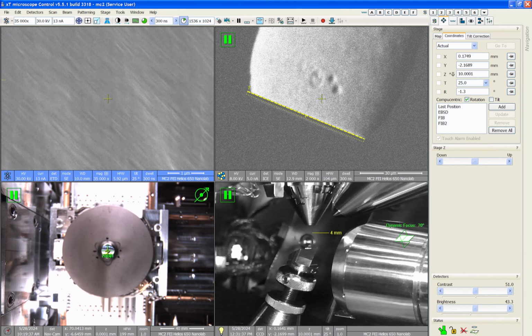Say none, SEM area. Let's see if I slow it down. Yeah, this is a little better. Okay. So if I go to my image processing, I'm using the standard recipe right now. The other recipe that's in this tool is the enhanced. And what the enhanced adds is, in addition to static background, it adds a dynamic background subtraction.